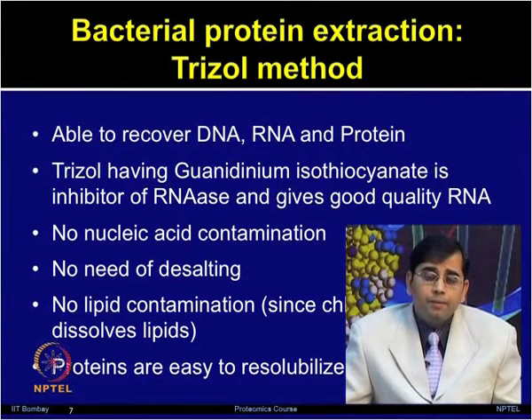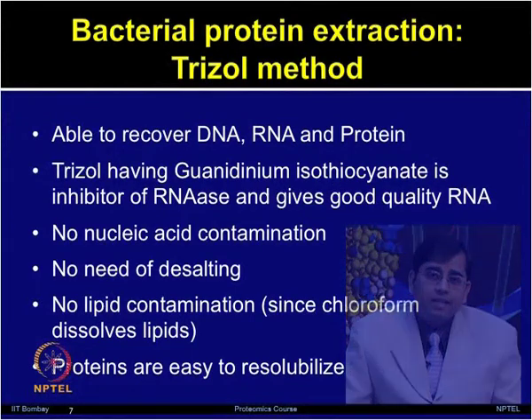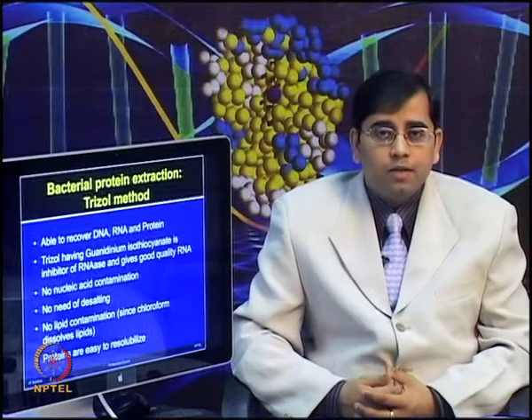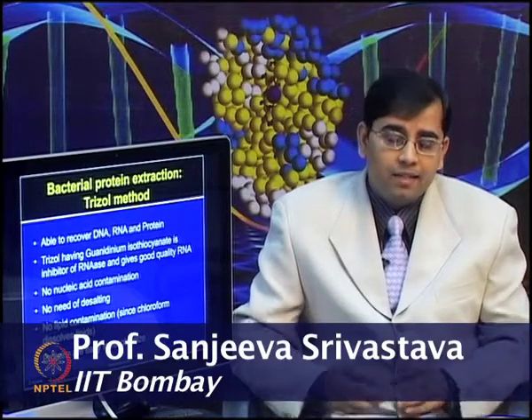So, this method is able to get rid of various types of interfering components as well as different types of contaminants. And finally, the proteins are easy to resolubilize after extraction with the Trizol based method. So, this method is very useful for extracting bacterial and other proteomes for analysis.